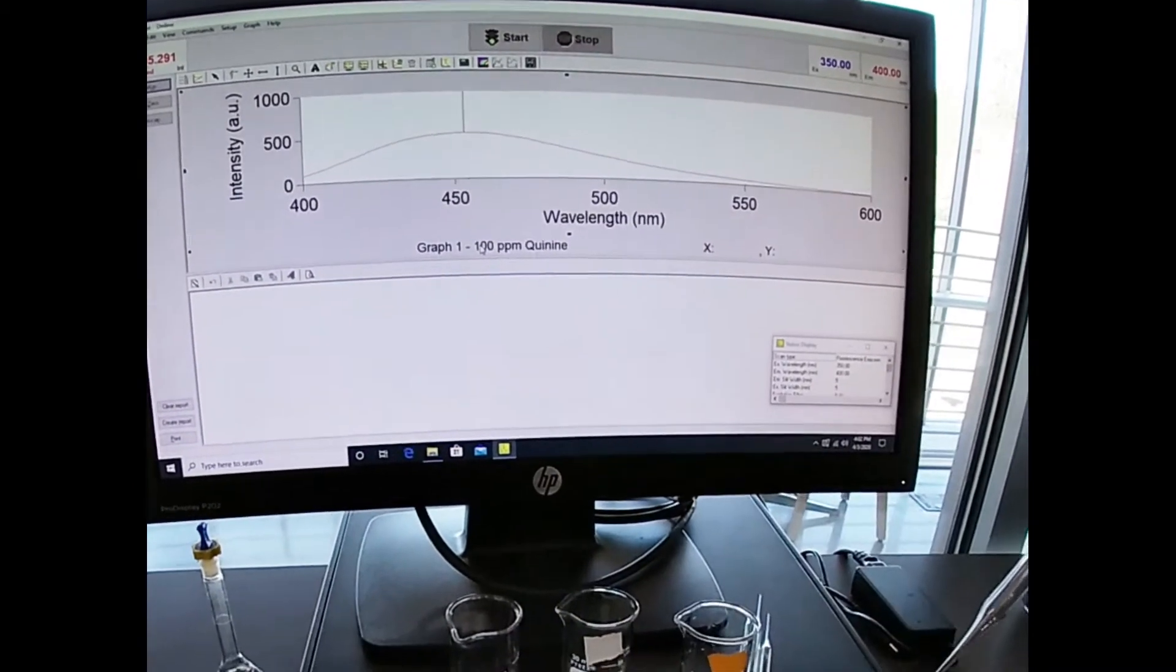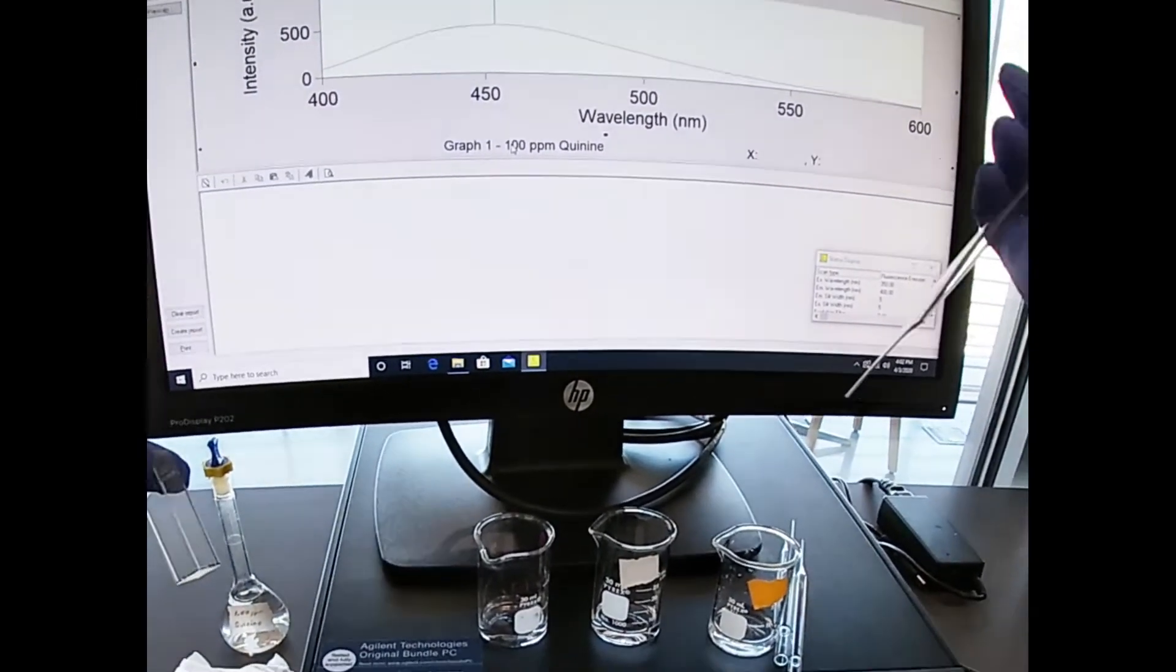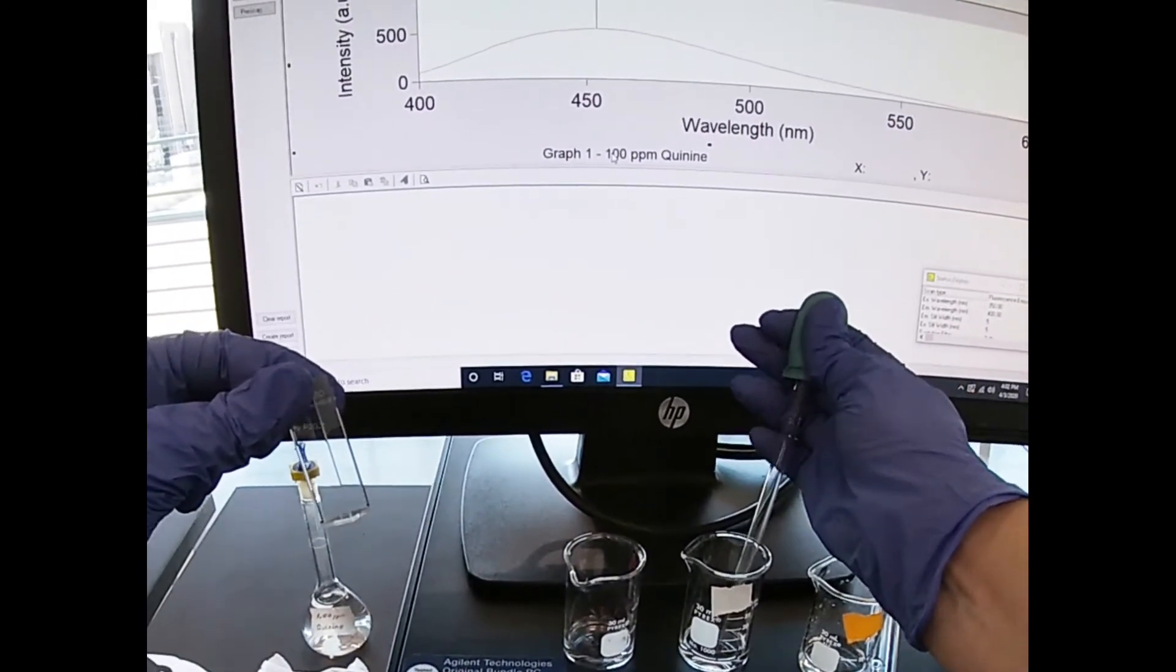Actually I'm going to do the reference sample first, so we can figure out what wavelength we want to see. So this is our reference sample.